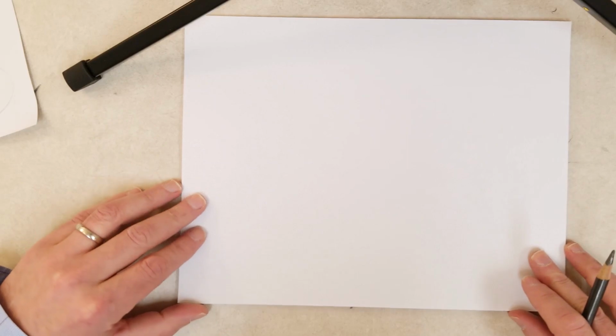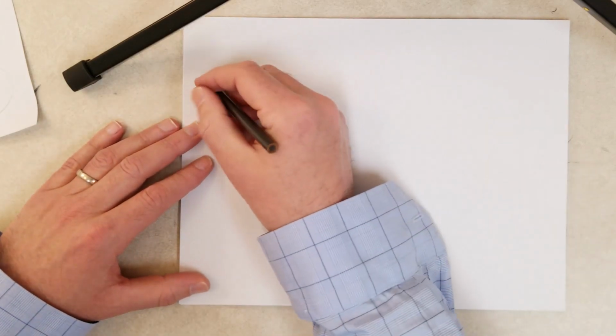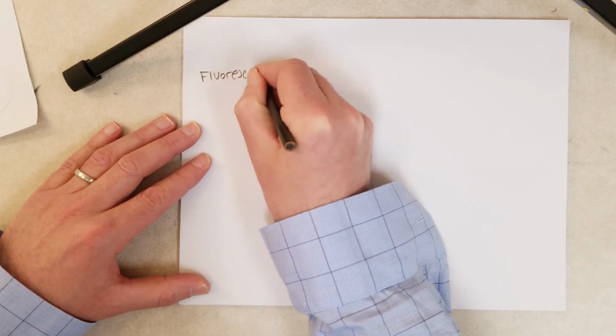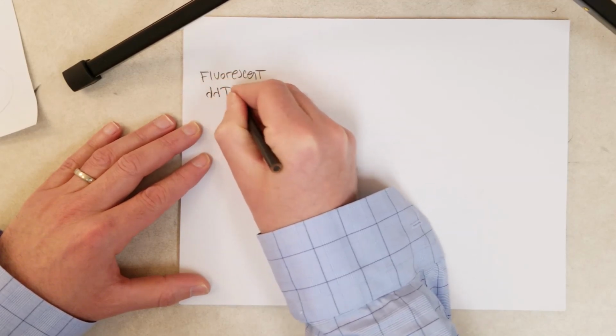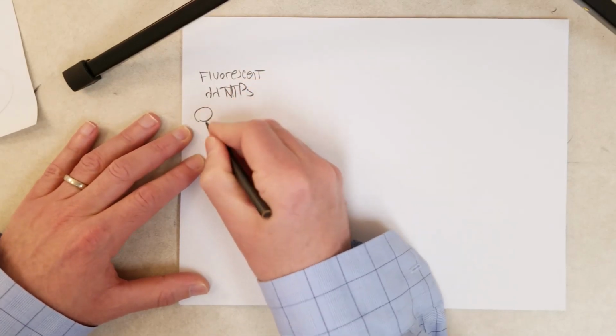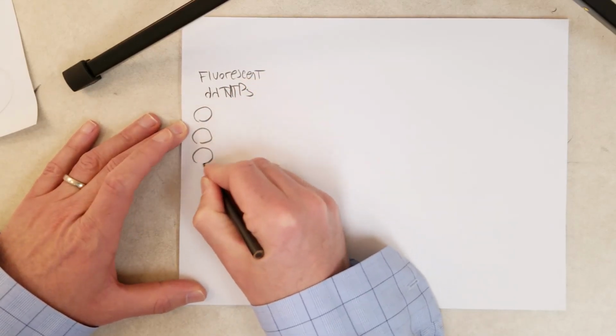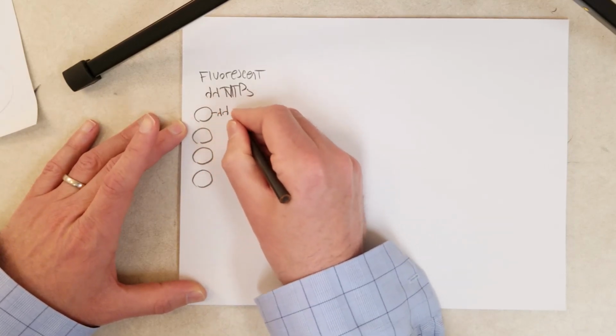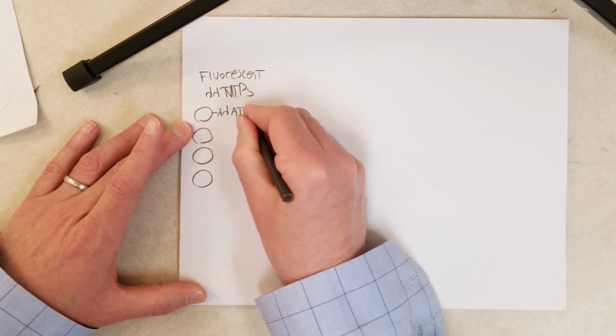Okay, like I said, those ddNTPs are fluorescent. And I don't know why they did this. This is the only thing that kind of drives me crazy about this technology. And maybe they updated it in the last year. I haven't reviewed it in the last year.